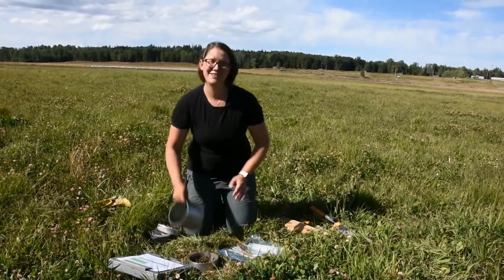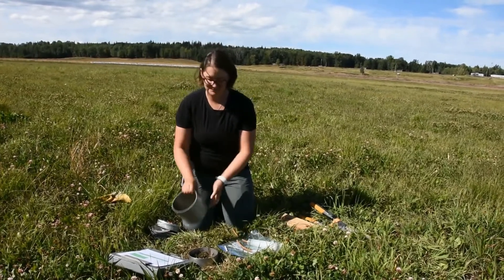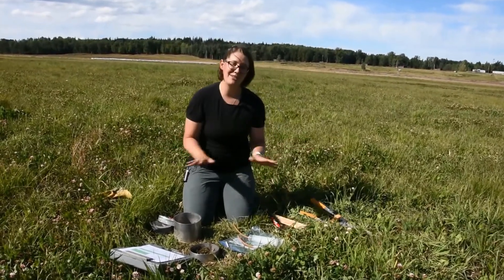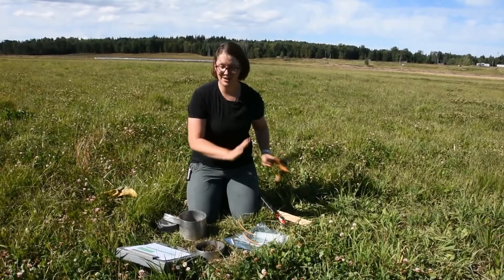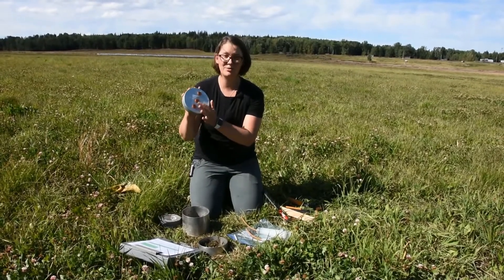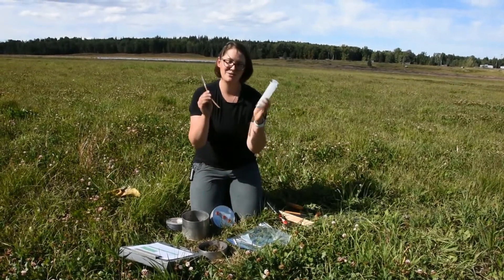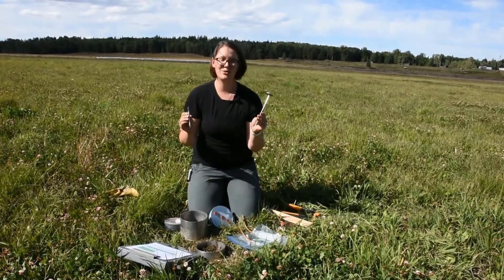For this test, you will need your 6-inch diameter large soil ring, a way to hammer in the ring — so a sledgehammer and a wooden block. If you are working in a field with covered soil, you might need some clippers to clear out the area. You will also need a lid with your rubber stoppers on it, some duct tape, and the Draeger apparatus tubes — so that includes your syringe, your needle, the tube itself, and a soil thermometer.